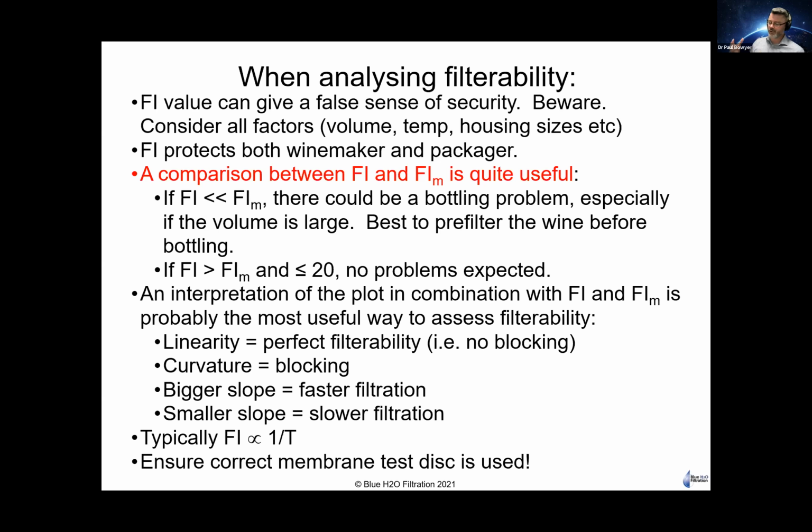And this is the point. The filterability analysis is just taking the wine for packaging and putting it directly onto a membrane. So it's not referencing the pre-filters that might be in place, but that's fine. It's not meant to do that. It's very complex to do that.